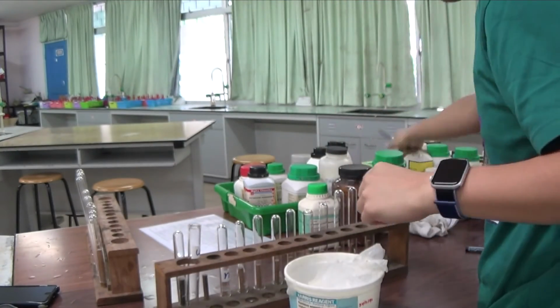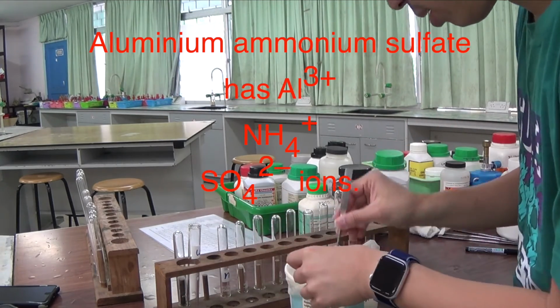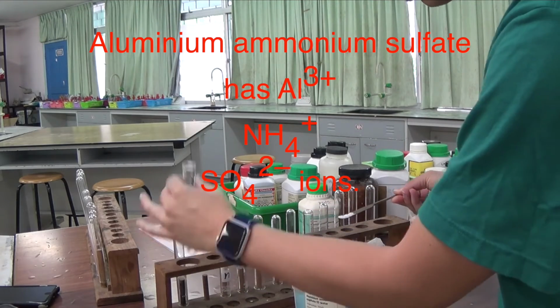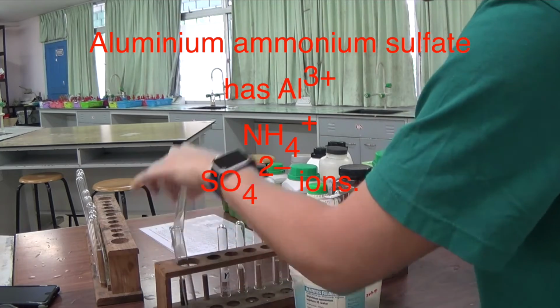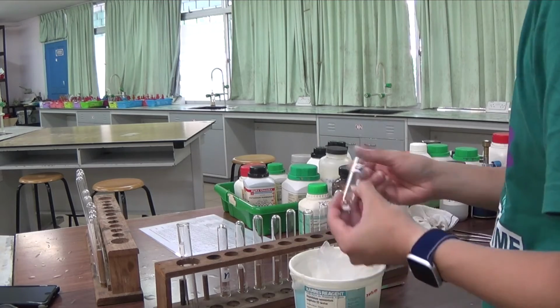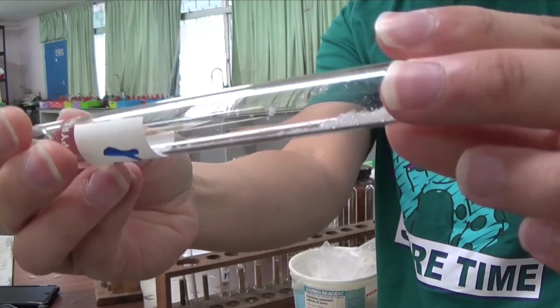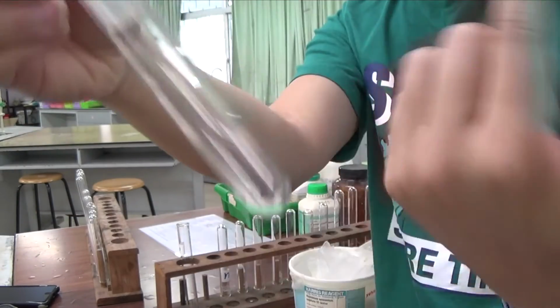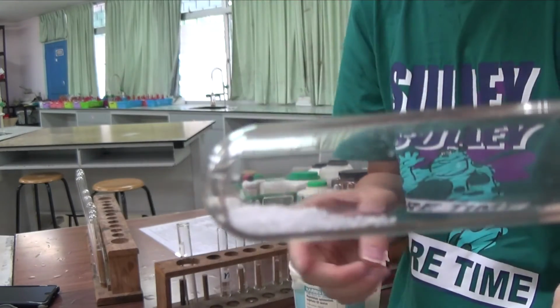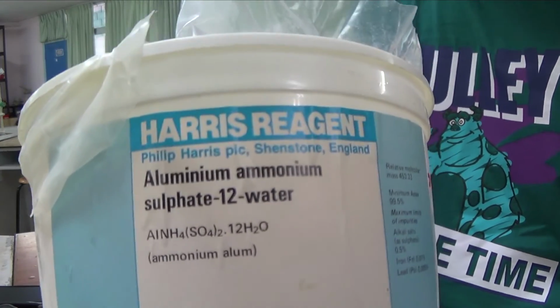Clean spatula. So in the real deal, you might be just given the solution, or you could be given the solid, alright? I want to start from the solid because I want to show you the water of crystallization effect. Okay, so this is a white solid. This is a dry test tube. If it is not dry, it will obviously have stuck on the side. So this is a dry solid. It's very, very crystalline. It's a white solid. It's ammonium aluminium sulfate. It's hydrated.